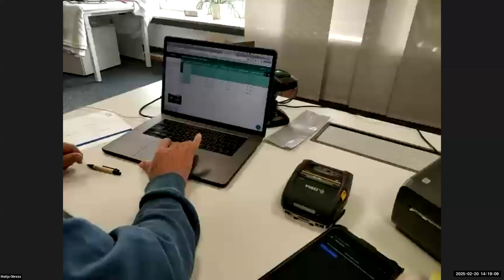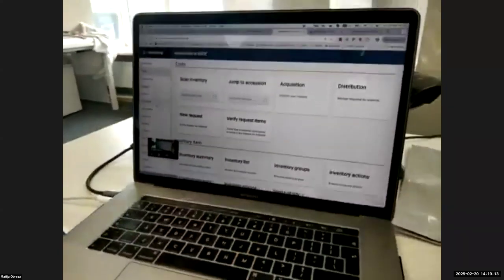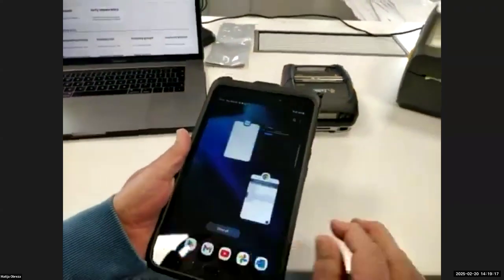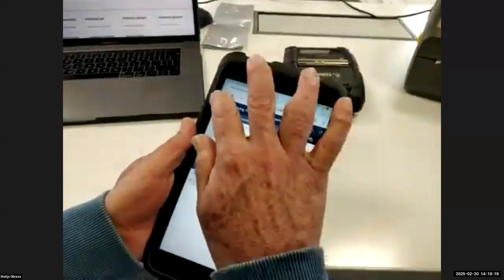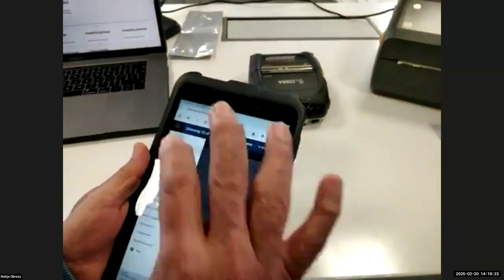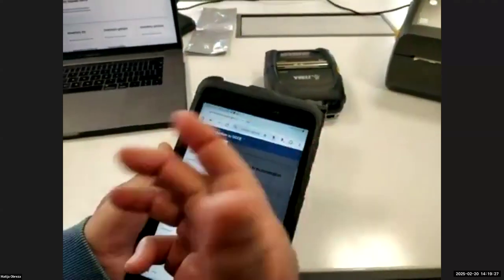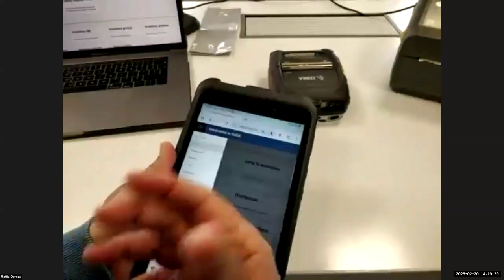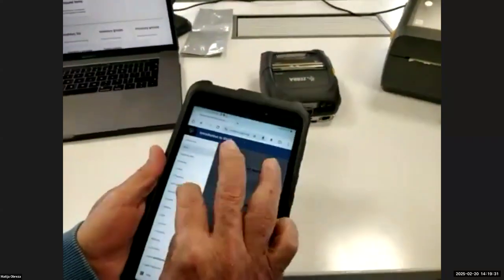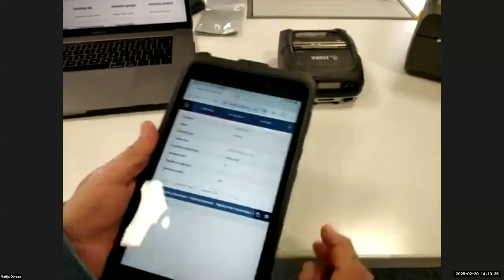The next example that we want to show you is, let me use this one. The idea is to print the seed viability. Of course, we need to prepare the material to be tested and create the seed viability, and we have this option.